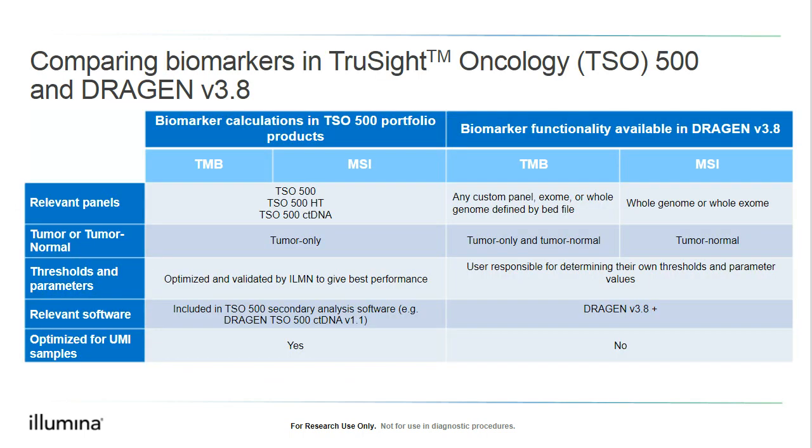Also, just to give everybody some clarity, we are comparing how these biomarkers compare with the TruSight Oncology panel that Illumina also has. So we are just trying to show you the differences in terms of the implementation of these biomarkers for the TSO 500 portfolio and what's available in DRAGEN 3.8.